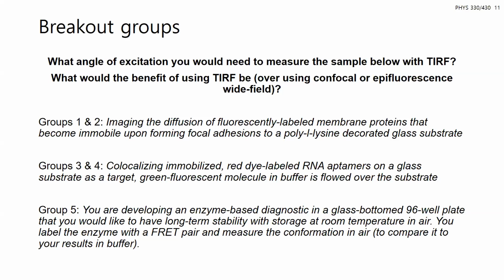And Rose and her group had a good point: you're not going to see autofluorescence if this is in a cellular environment from the cytosol. And membranes are typically studied by TIRF since it is a very interfacial process. That's pretty good. Okay, let's move on to groups 3 and 4 then. If you guys have some representatives to talk about what angle you got and what the benefit would be.